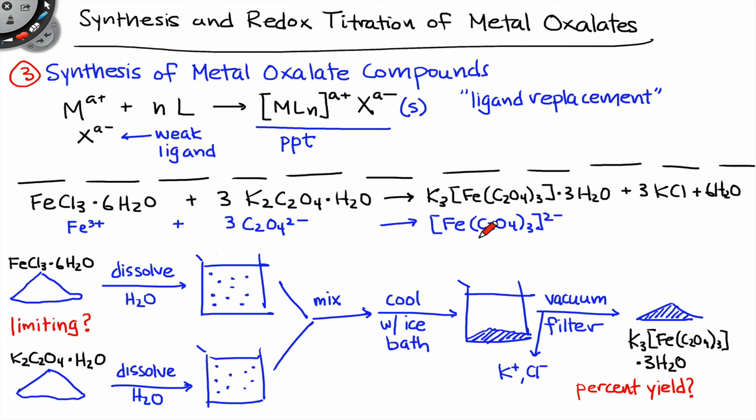To quantify the purity of your sample, we're going to use redox titration of the oxalate inside the sample with permanganate. We'll talk about that in a separate video.